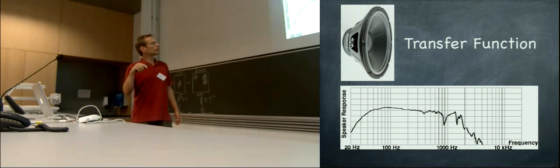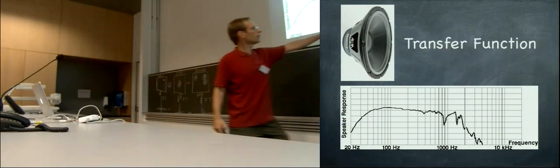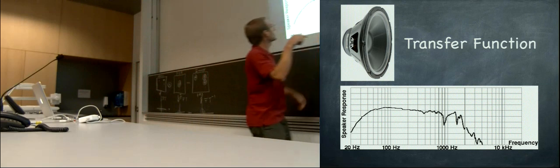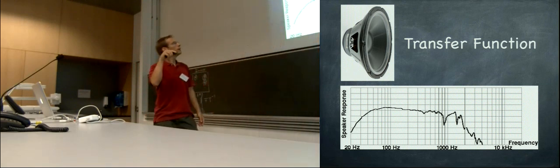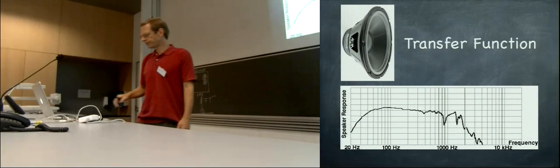It's good at low frequencies, but at the high frequencies, it's really bad. Yeah, so the high frequencies, bird sound, you would not be able to really well understand with this speaker. Maybe a little bit, but it's far too low. Yeah? So the perfect transfer function is 100% flat for bass and treble in all frequencies.